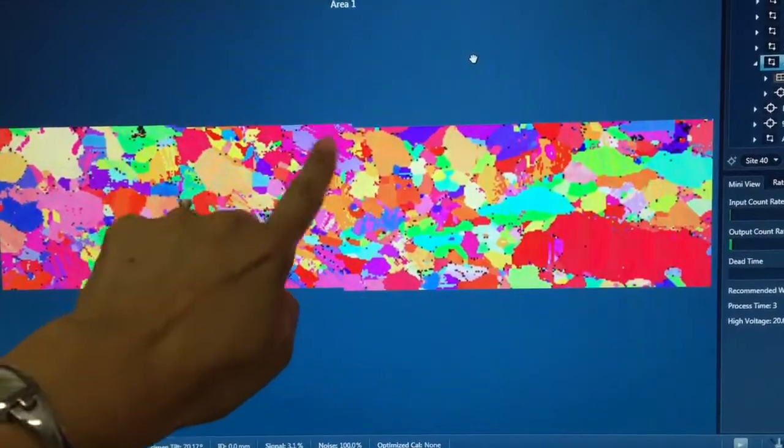Here you can see things like twins. These are twins in the plagioclase grain. There's a couple more grains with twinning in them, very common in the feldspar. But you can see that even though there's maybe about 5 phases in this map, there's lots of different grains in here. The grain size is actually quite small. So it's a very powerful way of collecting data.